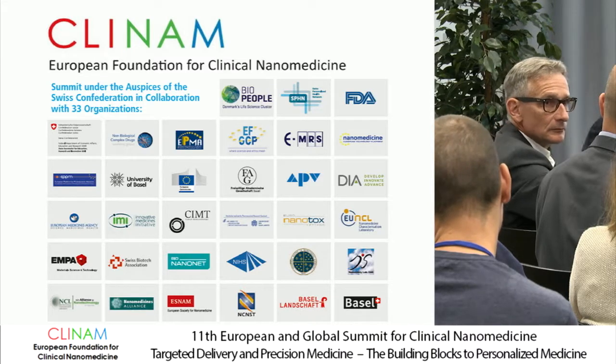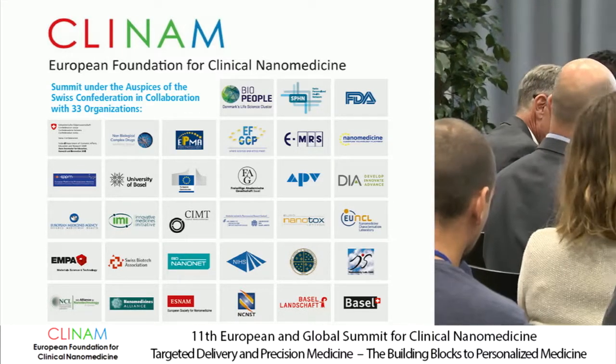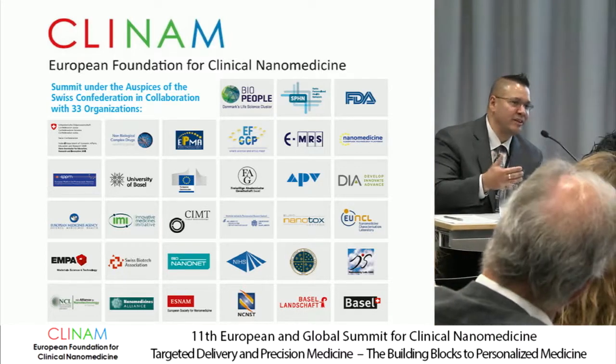And I'll just comment on that, the whole sizing as a CQA. So obviously there's many other parameters beyond sizing, right?